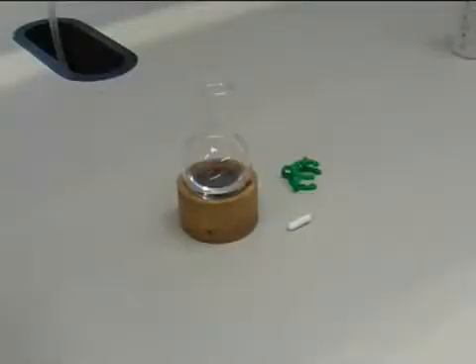Welcome to rotary evaporation, where I will show you the technique. Before you set off, make sure that you have removed your magnetic stirrer bar from the round bottom flask and have a green clip ready.